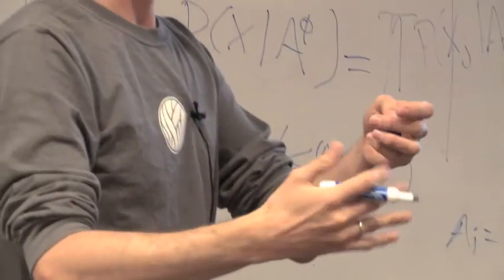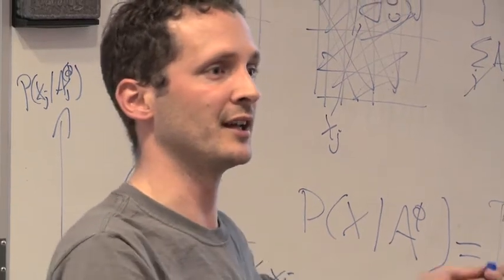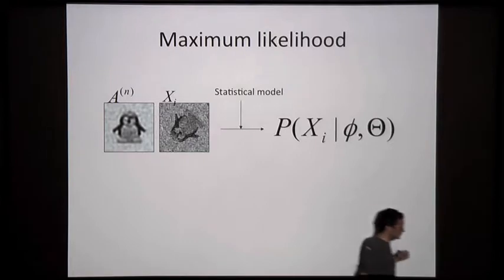So if we knew all these phi's, optimizing the likelihood function is just taking the average of the images. That was a little to the side. If you don't like formulas, come back to me now.